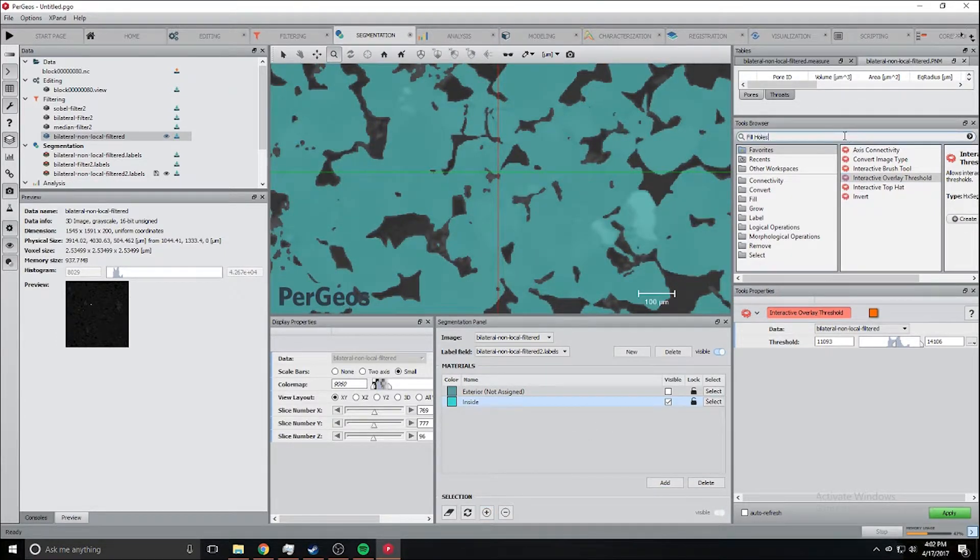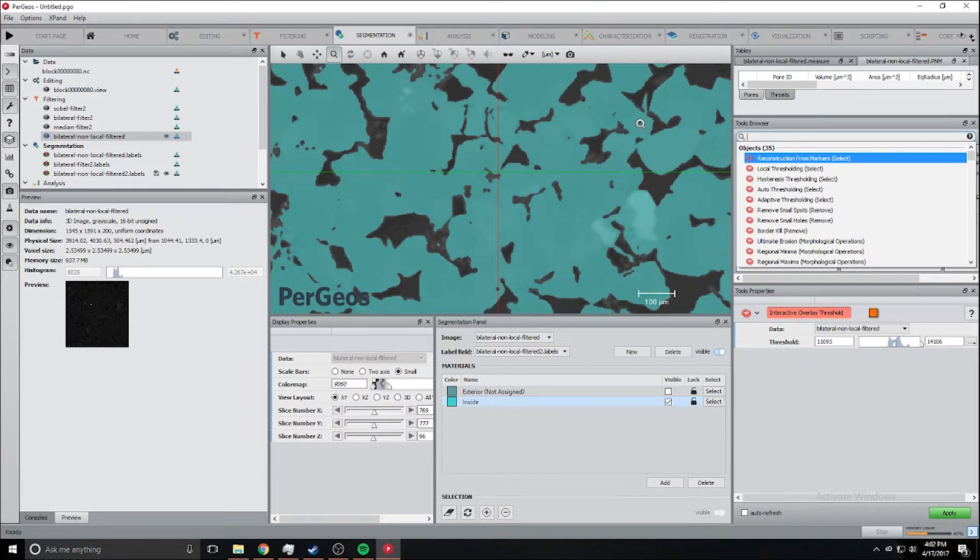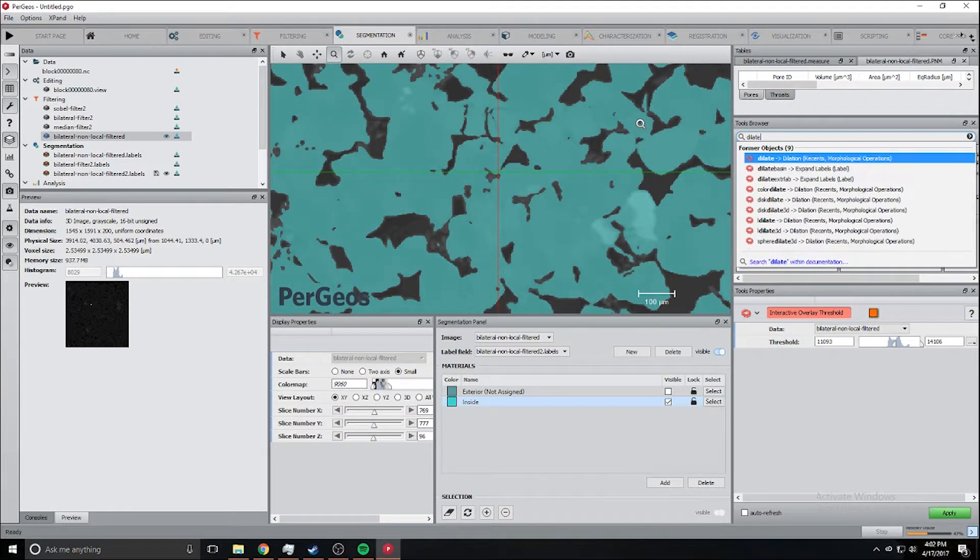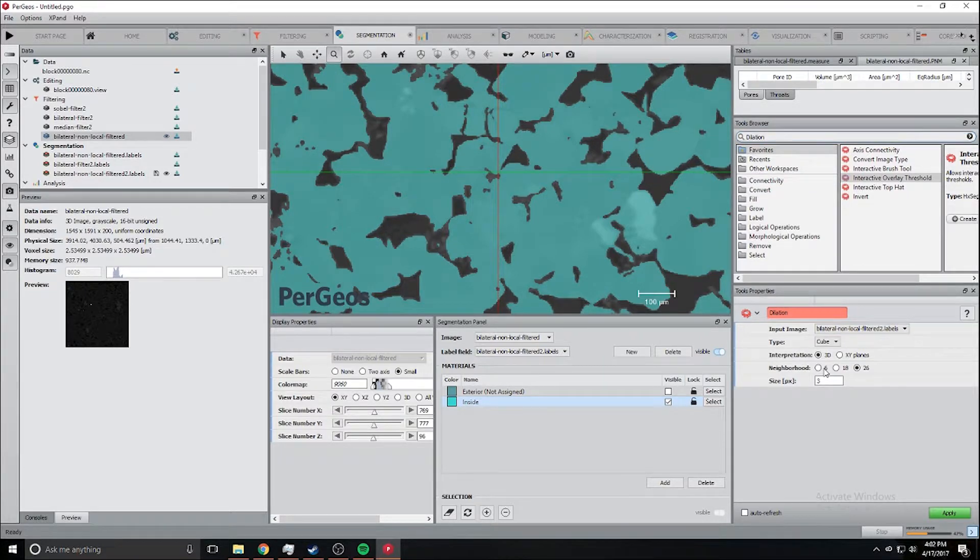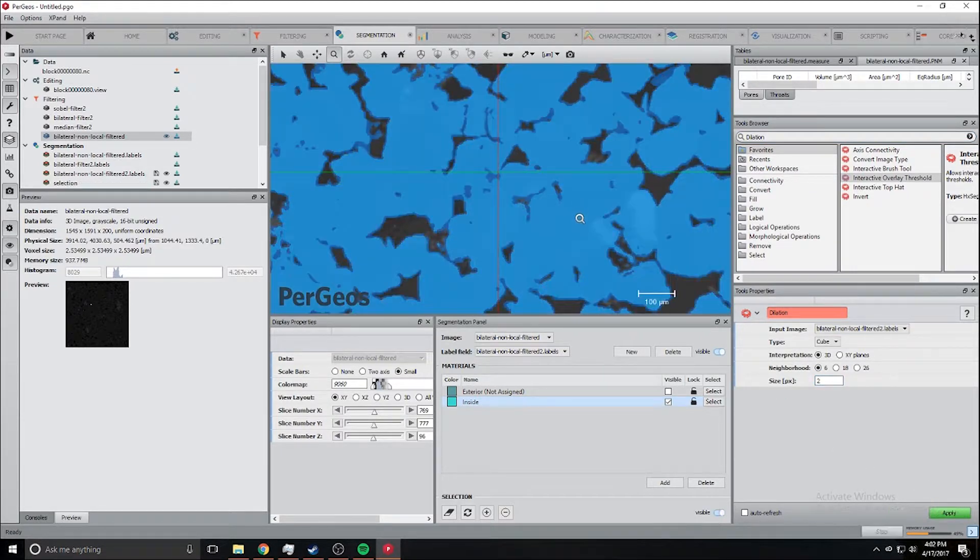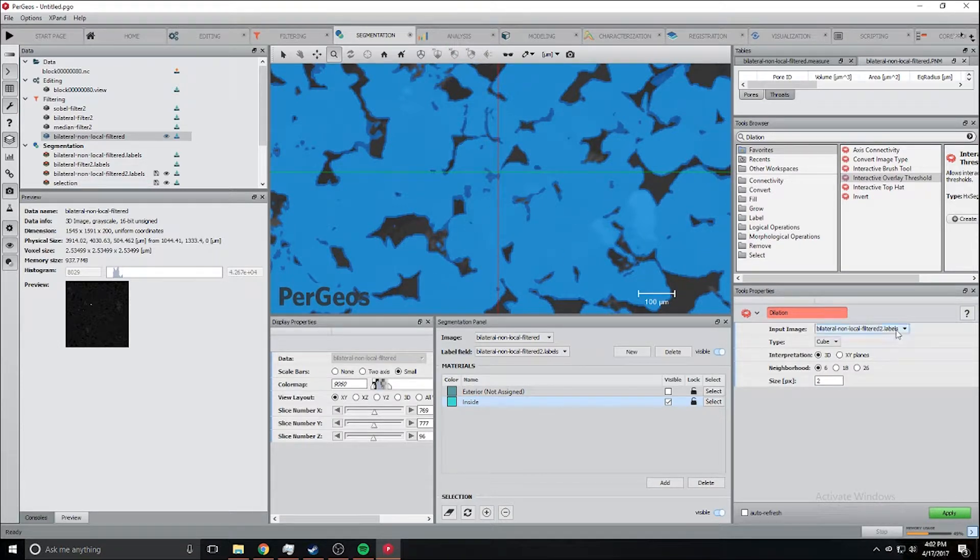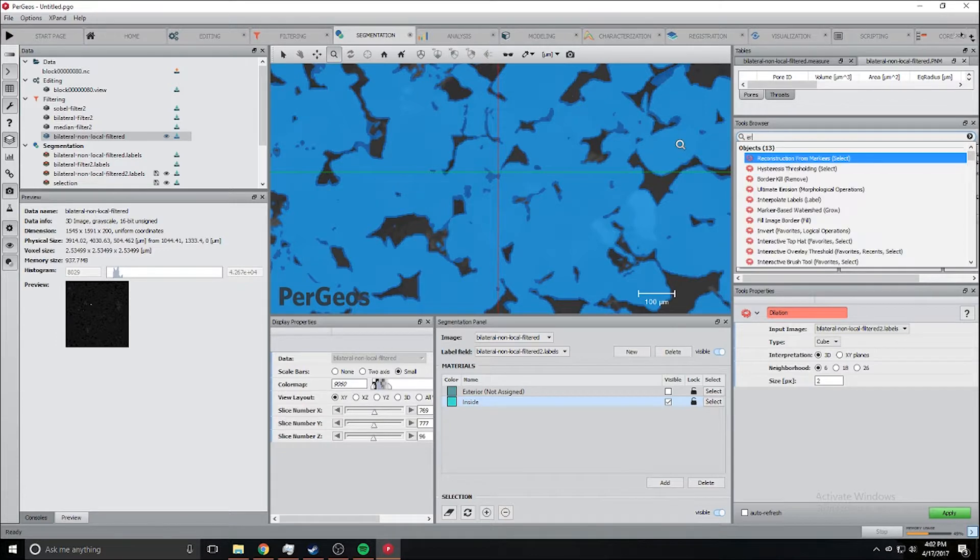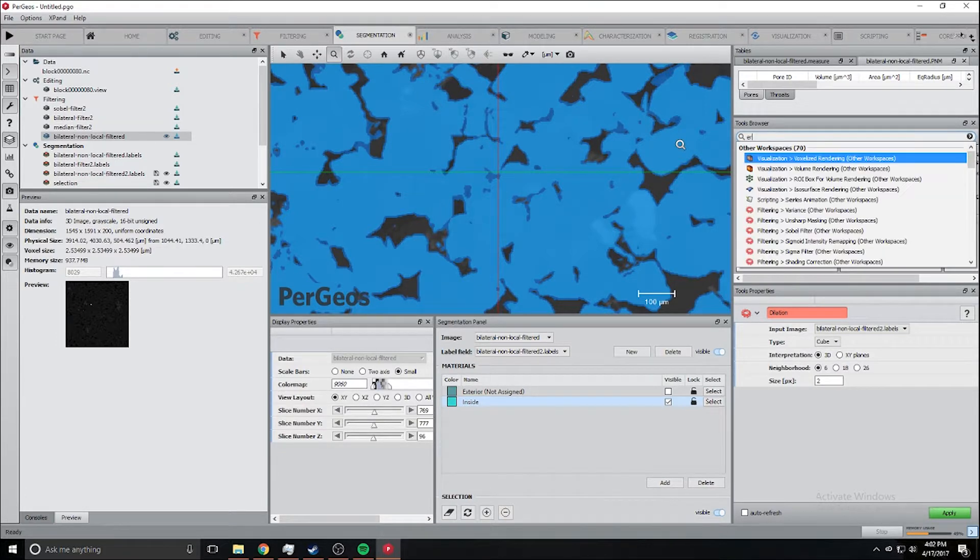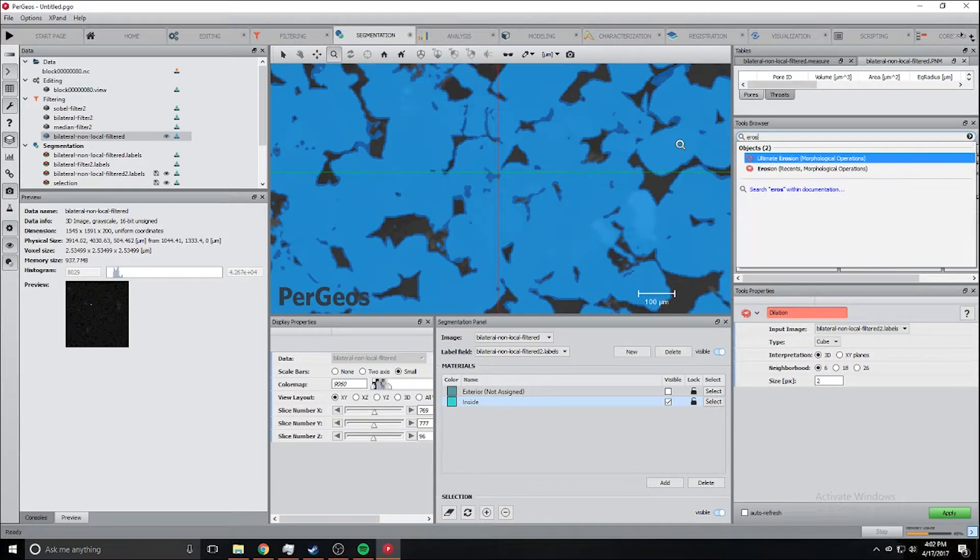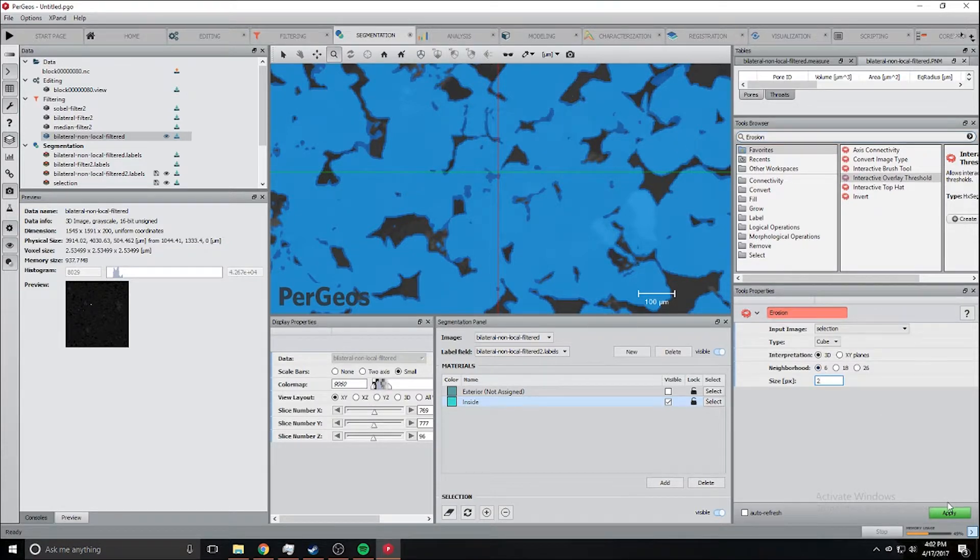The next step is we're going to dilate it and then do a very small dilation just like that. Just grow it a tiny bit and then we're going to shrink it a tiny bit using the erosion.